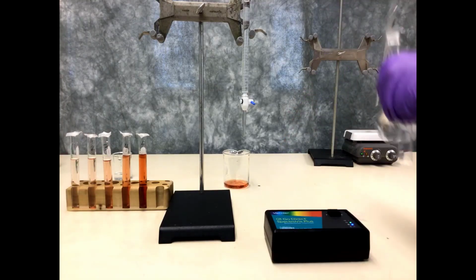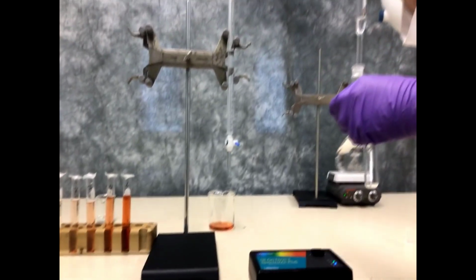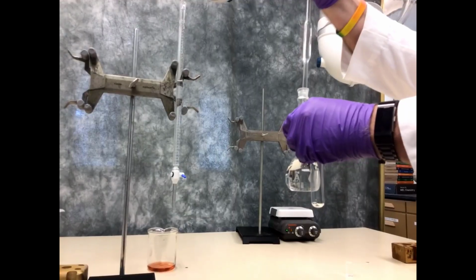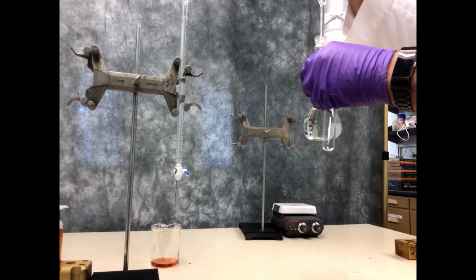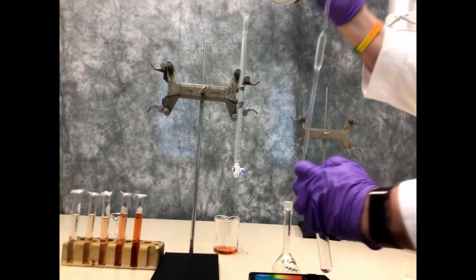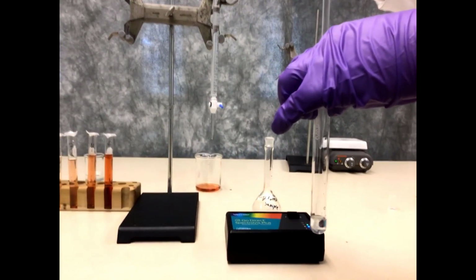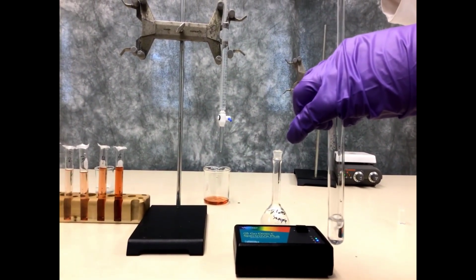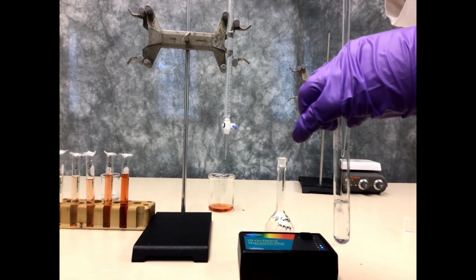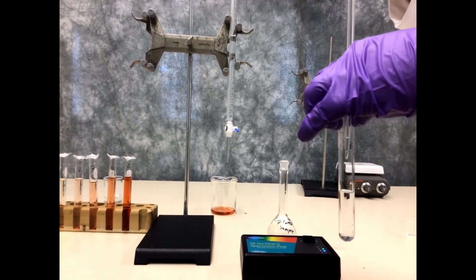Now we're going to make a test tube with our sample in it. We're going to take 10 milliliters of our sample, again using a volumetric pipette to get exactly 10 milliliters. To this test tube, we're going to add 5 milliliters of our thiocyanate solution, making a 15 milliliter total solution. This is, in effect, another dilution step because we're going from 10 milliliters volume to 15 milliliters volume.